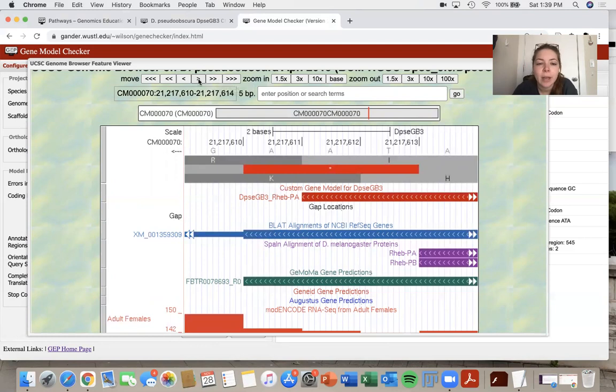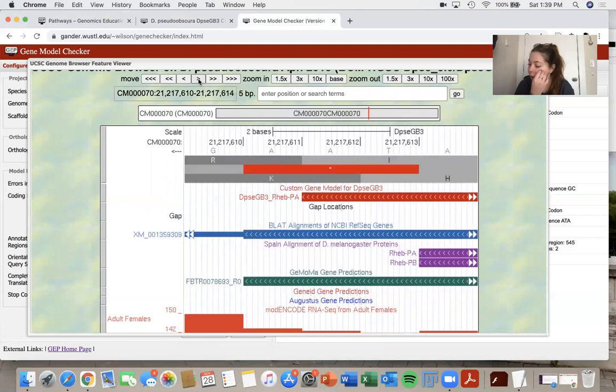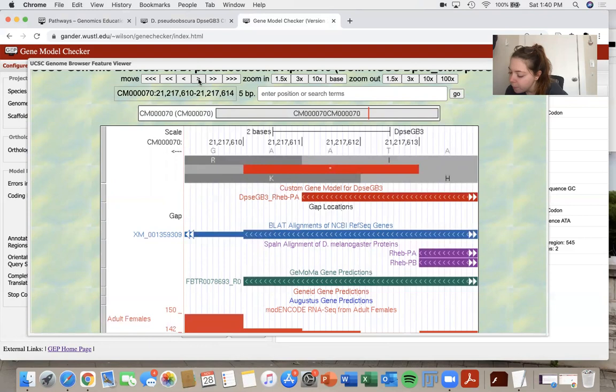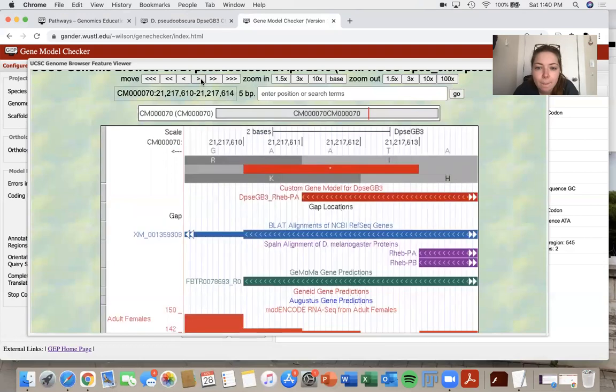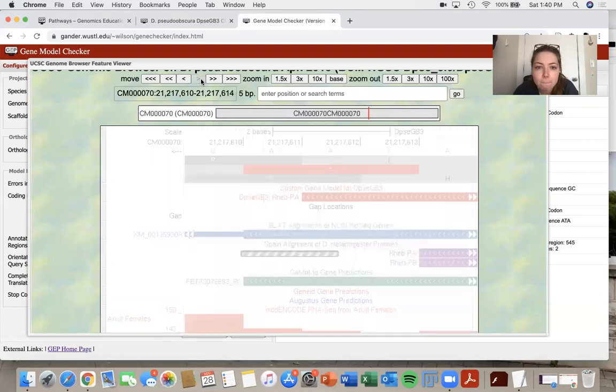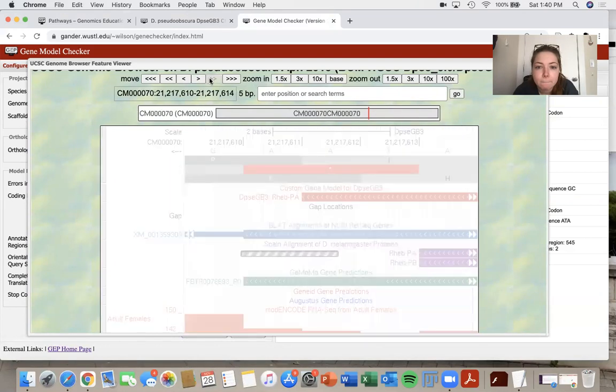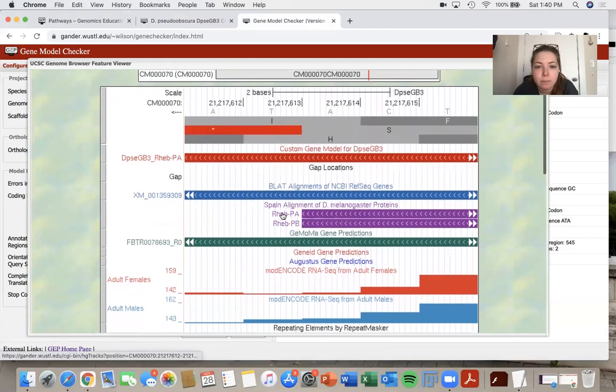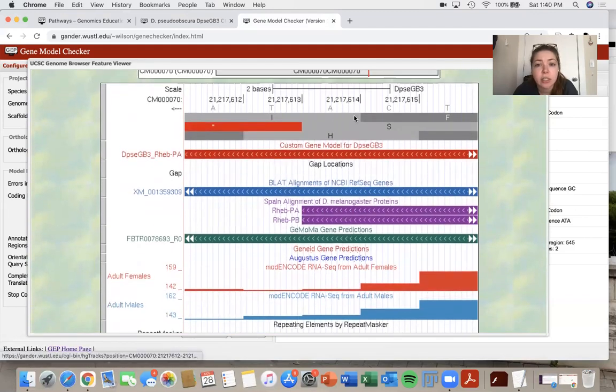So my coordinate for my last exon, I have my indication with me here. So I'm going to look at that. So I had six, one, five. So two, one, two, one, seven, six, one, five. However, it looks to me that it's actually two, one, two, one, seven, six, one to four.